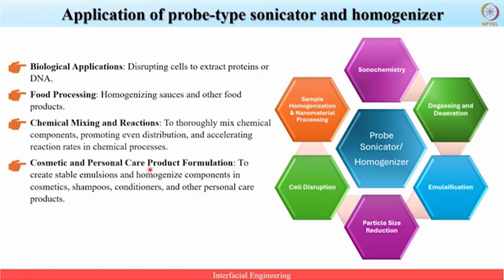Now let's move to the demonstration part. Now that we have covered all the theoretical aspects, we will move to the practical demonstration. Our colleagues will show you how to use these devices with specific samples. Through this, you will see firsthand how the probe type sonicator and homogenizer function in real scenarios. Let's conclude this session here and proceed to the hands-on segments. Thank you.